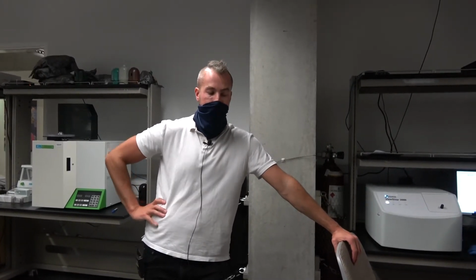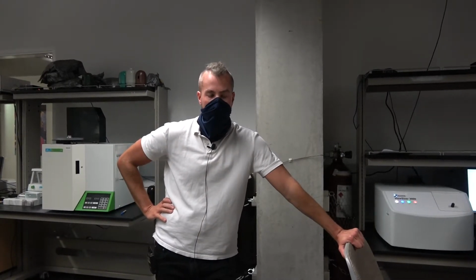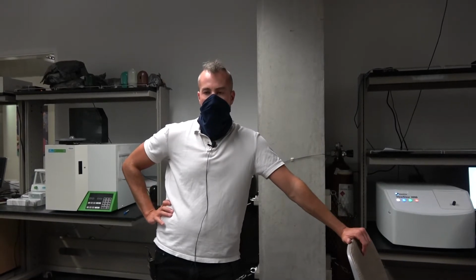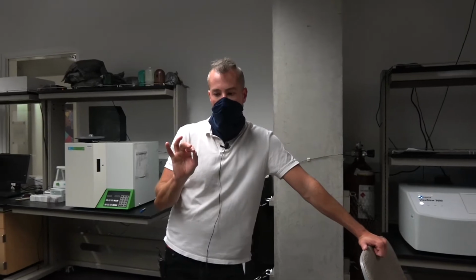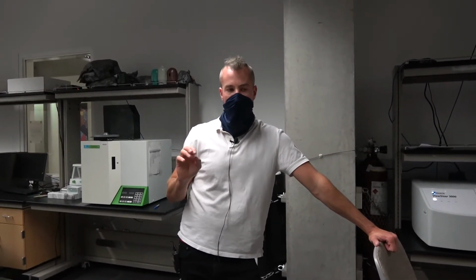And so therefore, by counting and doing the illumination volume, the instrument will give you the number of nanoparticles per milliliter. And so when I was demoing this before we bought it, I bought some calibration particles from Nanocomposites, and they had determined the concentration in terms of particles per ml to 3 decimal places.